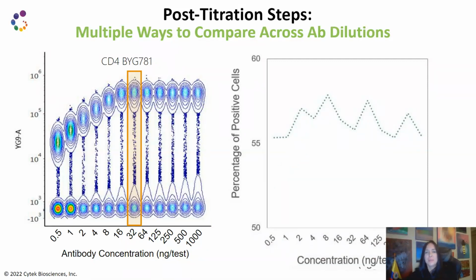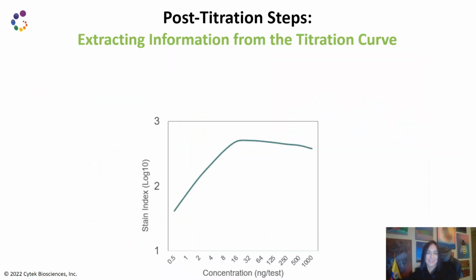And it's also important to monitor the percentage of positive cells. For CD4 it might be easy, right? It's easy to find what's positive even when you use 0.5 nanograms. So we are still separating the difference between separating concentrations and saturating ones once you reach the plateau. And we will see why that's critical in this slide.